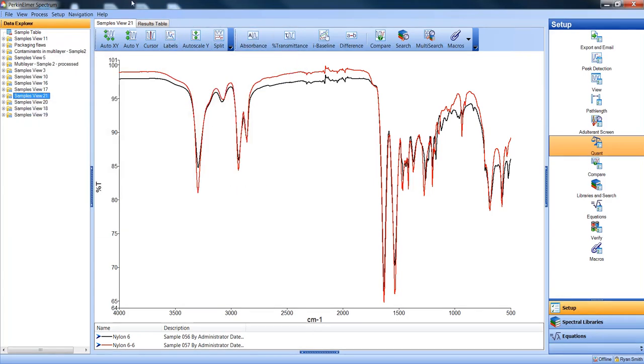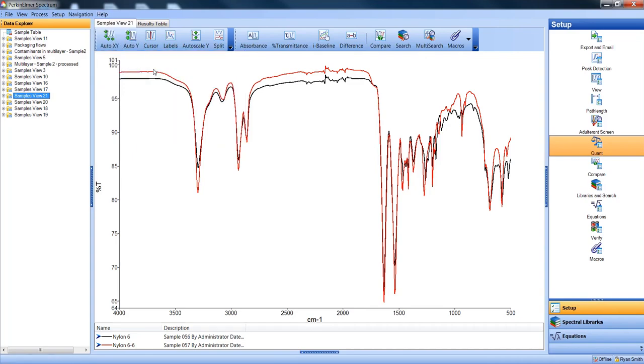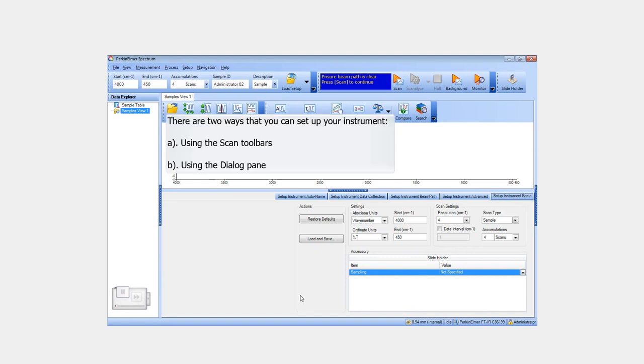Additionally, the software has animated tutorials built in which show the software interface. These animations cover a wide range of topics, including some shown in this recording. The animations include message boxes, as well as colored boxes to highlight areas of interest in the software interface.